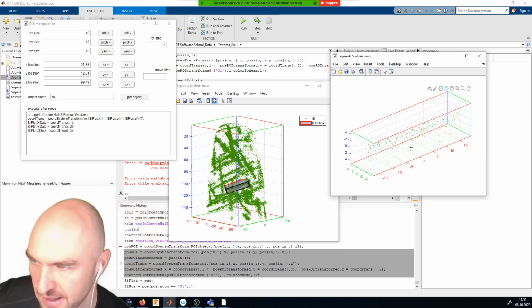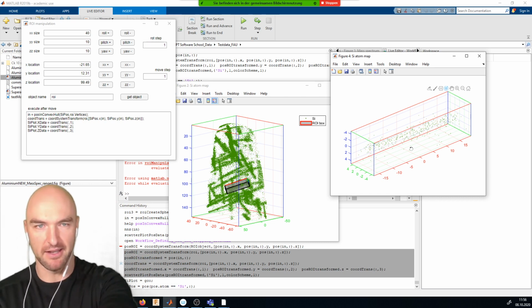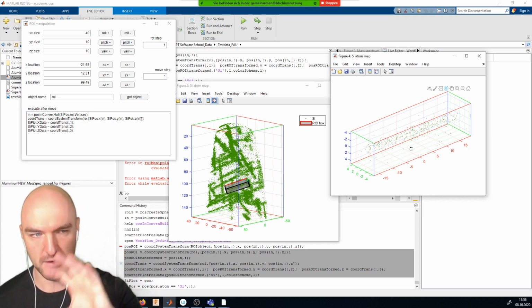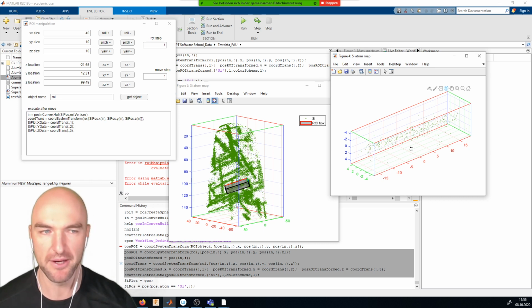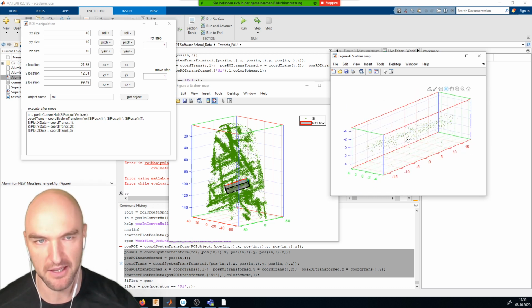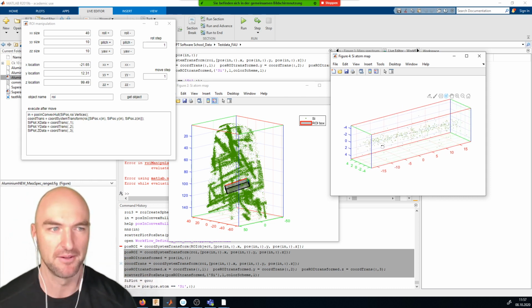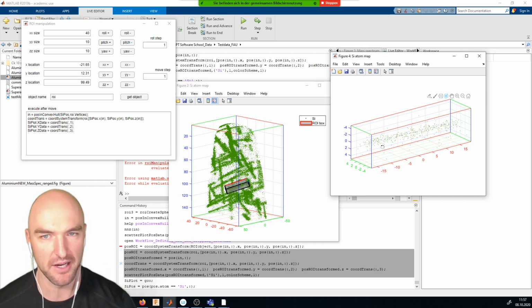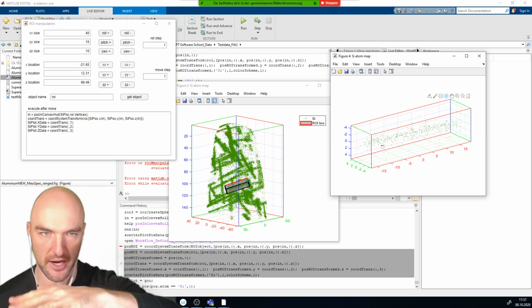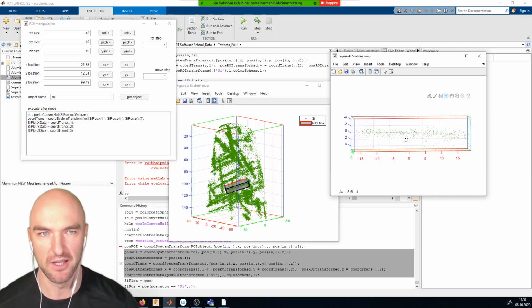Yes. So a quick explanation of what Andy is talking about. If you have an object in there, and in this case it's a rod, you can essentially calculate its moments of inertia. So you get a matrix of moments of inertia, and you can do a principal component decomposition of those. That would tell you that you have three very distinct axes, and that one axis is essentially along the rod here. You could use that as a sort of smart snap align function. It is actually a pretty good idea and not too complicated to implement. It would work pretty well for anything that's rod shaped or anything like a grain boundary or flat shape. You could use that very simply to align it.